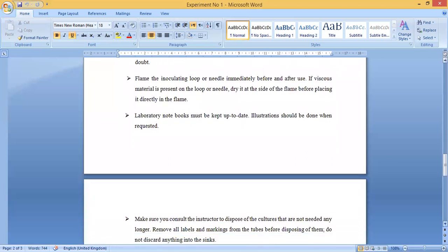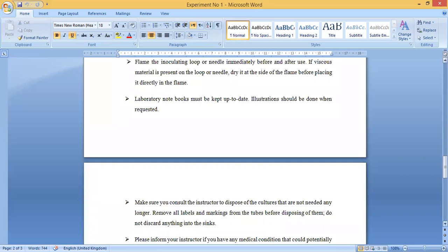Flame the inoculating loop or needle immediately before and after use. You must first flame the loop before use. If a viscous material is present on the loop or needle, dry it at the side of the flame before placing it directly into the flame. If the loop has any sticky material on it, the loop must be cleaned first.